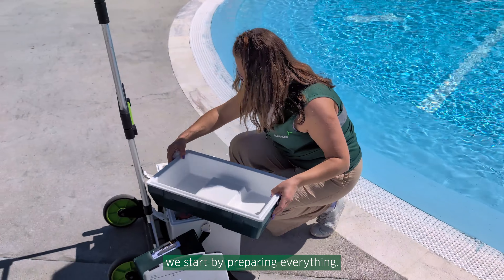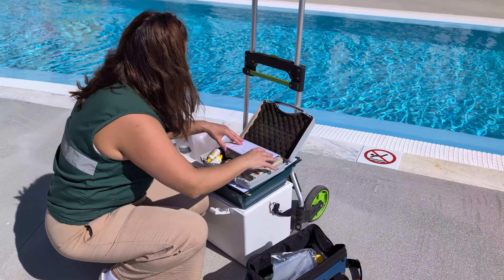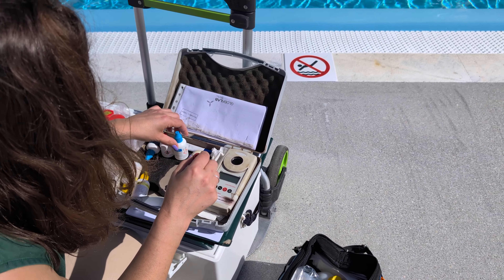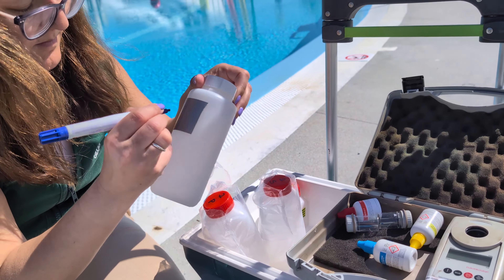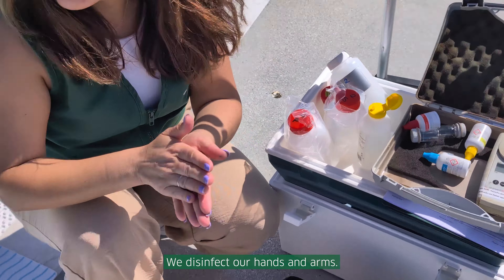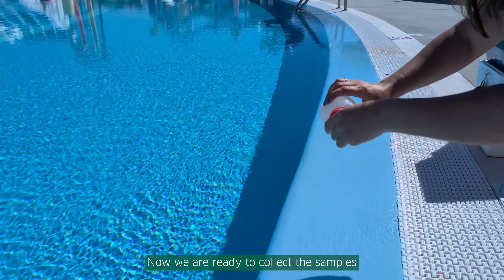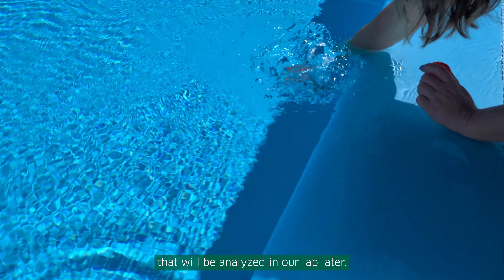There, we start by preparing everything. We disinfect our hands and arms. Now we are ready to collect the samples that will be analyzed in our lab later.